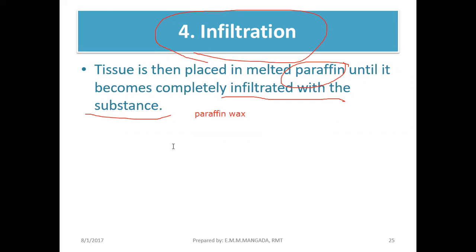So guys, ano ba yung purpose ng ating infiltration or yung ating impregnation? In the infiltration or impregnation process, we're actually filling yung spaces dun sa ating tissue.